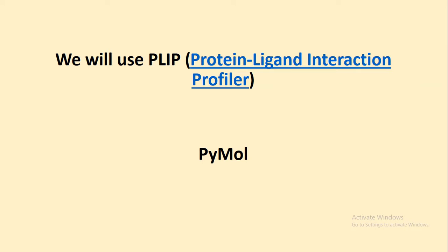In today's session we will use two things. We will use PLIP, that stands for Protein-Ligand Interaction Profiler, and we will use PyMOL.